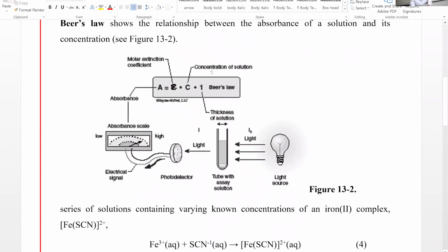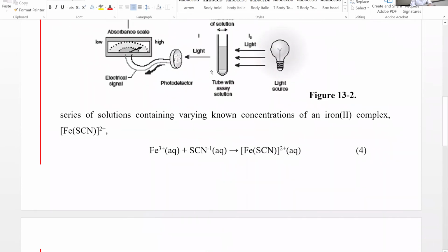So what is this experiment entitled? We have this chemical reaction. The product is a colored product. When we add different concentrations of the iron, we add a fixed amount of potassium thiocyanate. We measure the same amount, consistent from one trial to another, and we place it in the Spec 20 and read the transmittance. The higher the concentration of the iron, the more light is going to be absorbed.